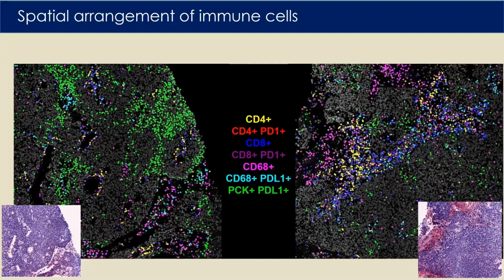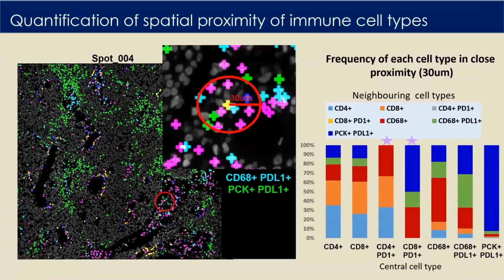Spatial analysis and cell arrangements are also the focus of our quantitative studies, as increasing evidence has suggested that the ways the cells are localized in the lesion or around each other can have prognostic values. The proximal locations of these cells could also suggest that there could be functional interactions between particular cell types. Again, using a neighborhood analysis approach, we studied the likelihood of different cell types or how the expression of protein signatures are in close proximity with each other.